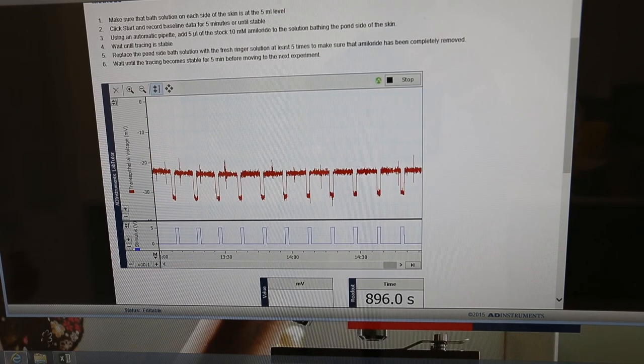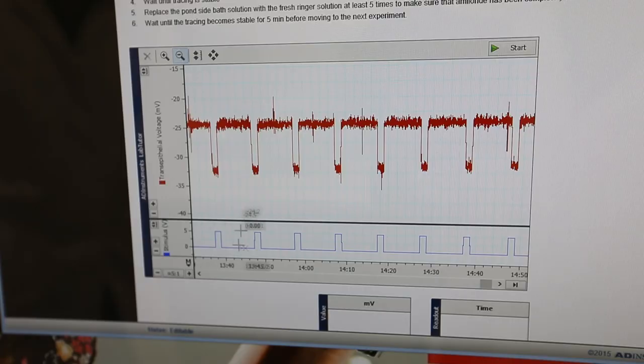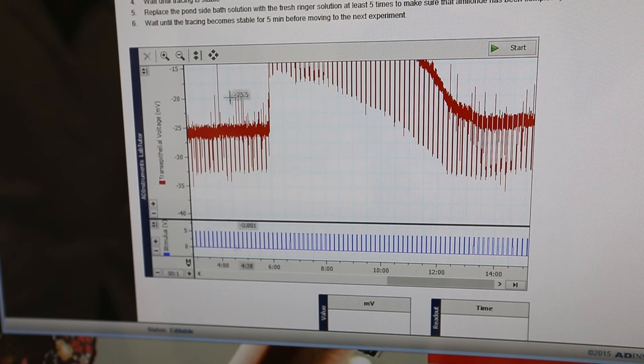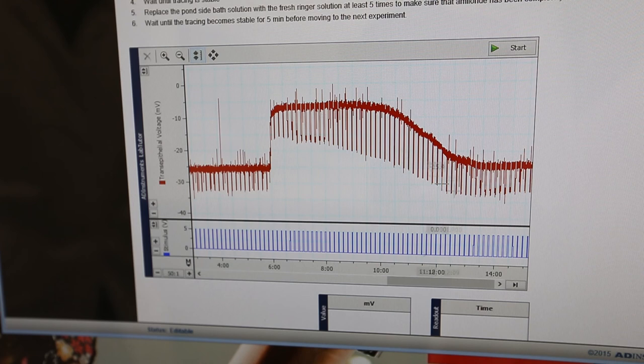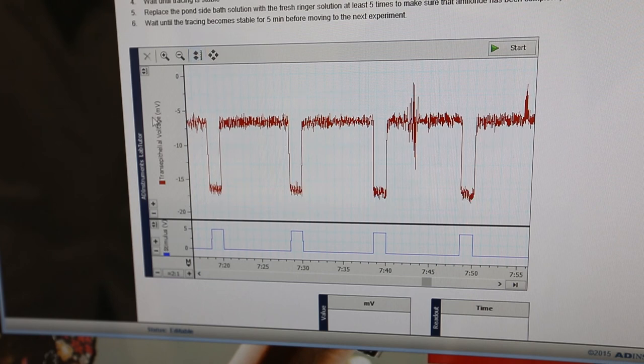To take measurements from your amiloride trace, press the pause scrolling button in the lower right-hand corner of the window. Next, zoom out so that you can see the entire trace. 50 to 1 will probably be sufficient. Then click on the auto scale button. Now highlight a portion of the top stable part of the amiloride trace and click the zoom button. Again, rescale to bring the trace into the window and measure V1 and V2, copying the results into Excel if you wish, for use in your calculations.